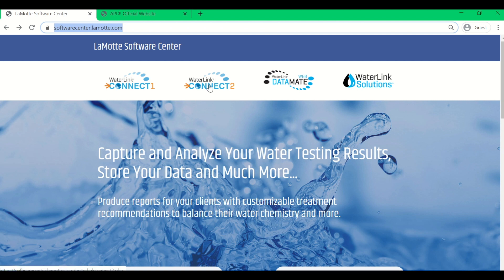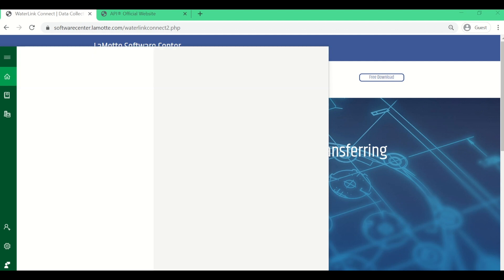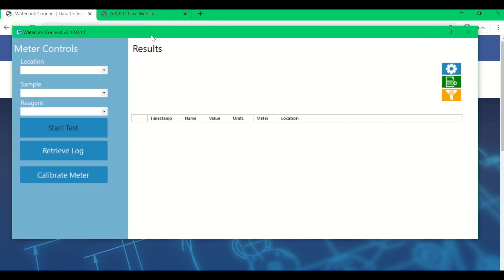Once you get to the link, you are going to want to click Waterlink Connect 2. From here, on the right-hand side, you will find a button that says free download. Click that and you will be prompted to download the software onto your computer. Once downloaded, you can look for it in your search and this screen will pop up, confirming you have downloaded the software correctly.